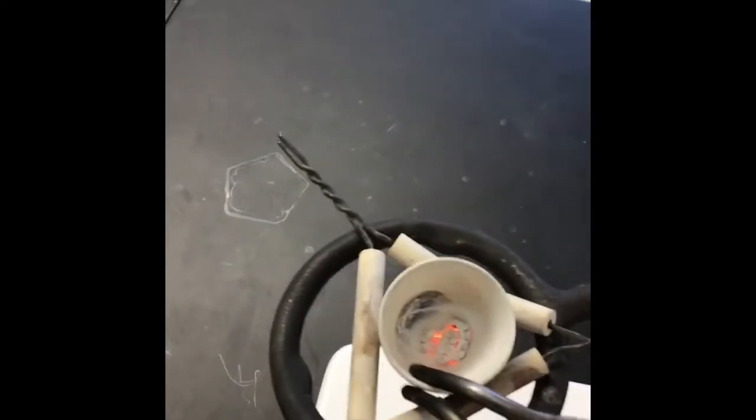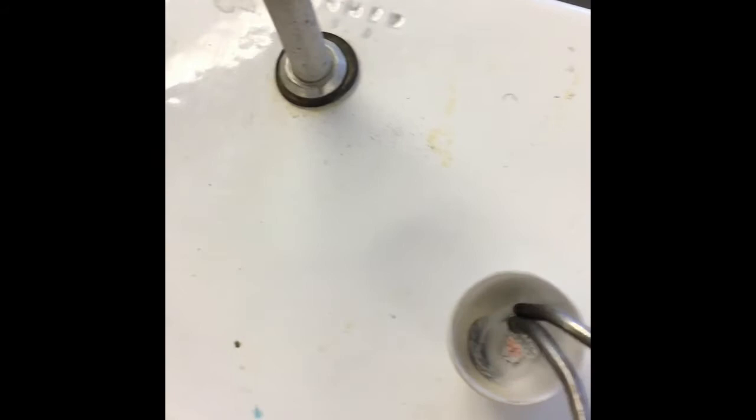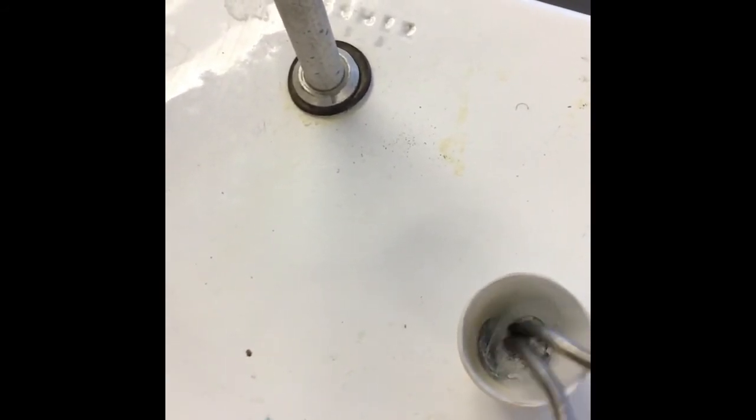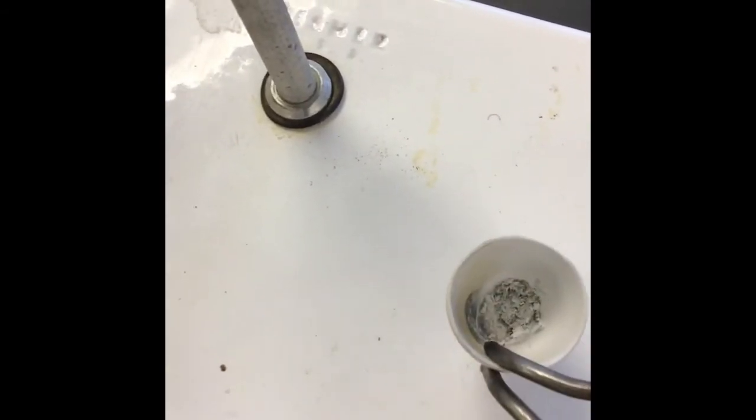And now we have our product sitting there. What we can do is take it off the stand and set it down. You can see that it is still kind of hot there, but you can move it around and you can see that it is a white powder. A white powder has formed in there. You can dump it out on the bench. So you can see that white magnesium oxide.